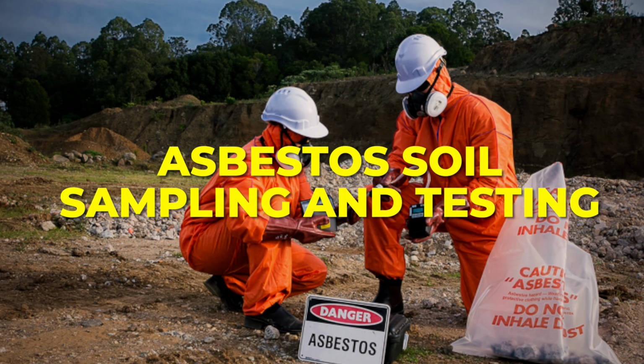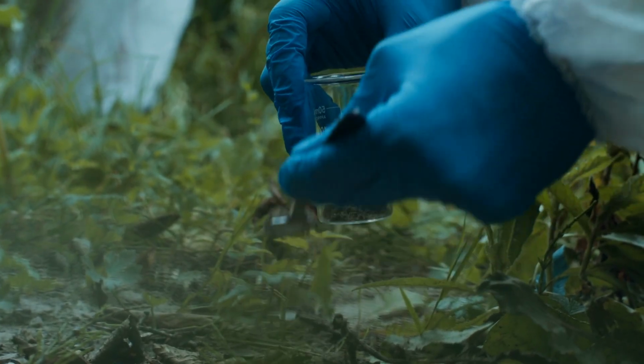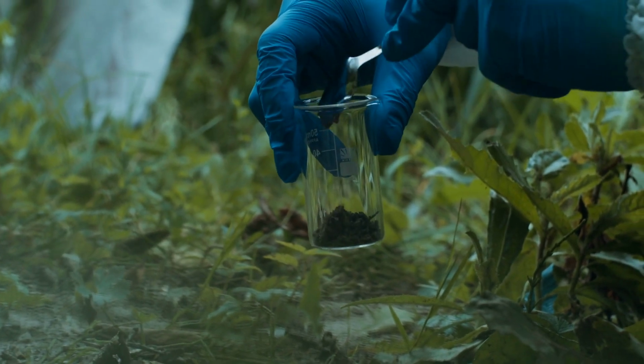Today we will dive into the crucial practice of asbestos soil sampling and testing, which is essential for any land that may be contaminated by asbestos due to past construction or demolition activities. Asbestos soil sampling and testing are key processes used to assess the presence and concentration of asbestos in soil, which can vary greatly depending on the history of the site. This sampling is critical to plan and manage any potential asbestos risk adequately.